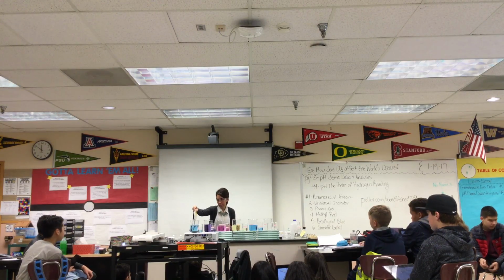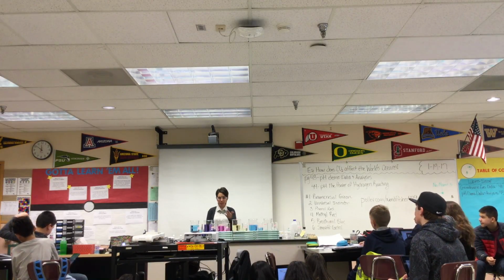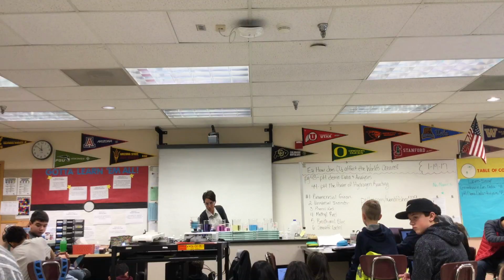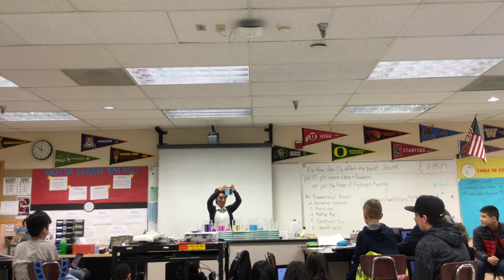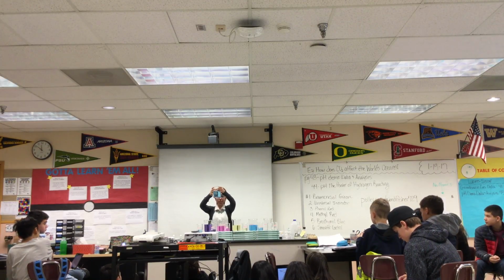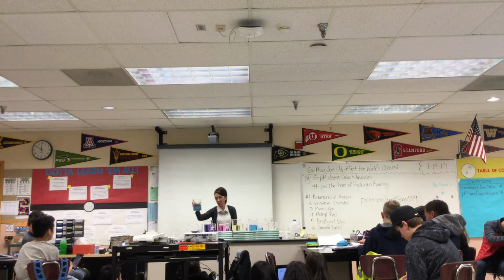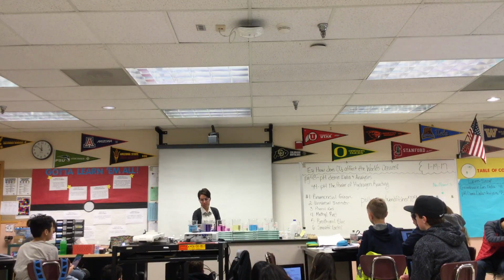So on your data table for Bromocresol Green, we need to take some before observations. Tanner and Daniel just said that we're around 8.9 to 9.0 for our initial pH. How else would we want to make some observations about this? It's blue. How else would you describe it? You can say liquid, and you can say clear or transparent, right? I think of this as being more clear. This is more transparent. It's blue, it's transparent. There are a little bit of bubbles on the bottom.